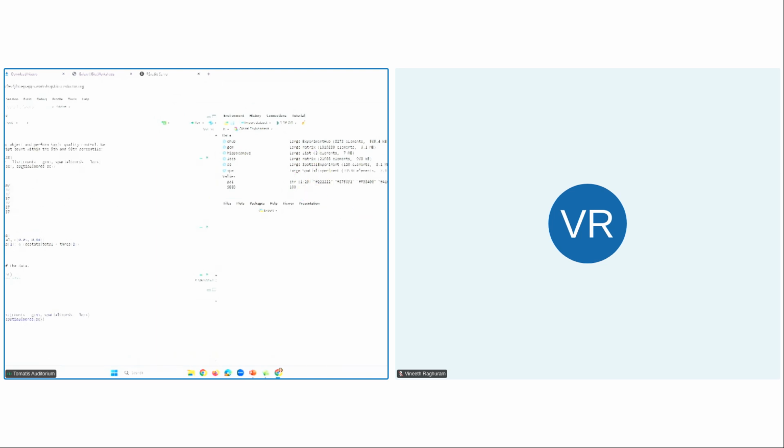The spatial experiment has a spatial coordinates slot that builds on the SCE, and that's what we use to extract the cell centroids. We perform basic quality control, just filtering by total count, between the 5th and 98th percentile of the whole dataset. That leaves about 10K cells. It's pretty simple. Then we do standard normalization, a log1p.